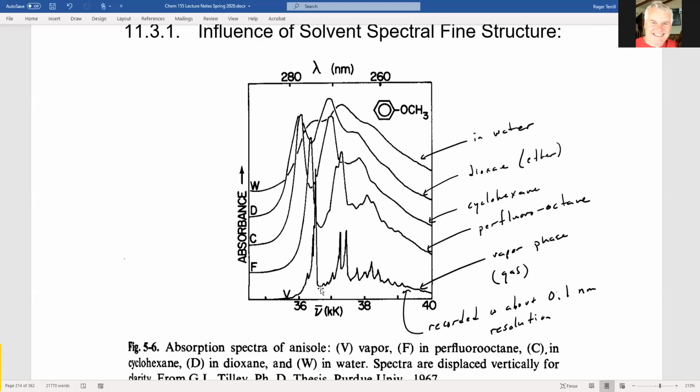So you get a spectrometer large enough and operating in a mode that puts it at high resolution so that you can take a point every 10th nanometer and actually see a different wavelength. And you don't see too much broadening over that 0.1 nanometer, right? And then you can get this type of spectrum. And this might be roughly optimal, let's say nearly optimal, for identification. But it's also kind of impractical.